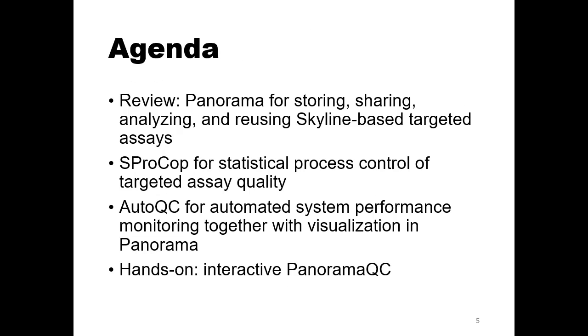So now that we have maybe a little bit of an appreciation for system suitability and what we're going to be doing on our mass spectrometer, I'm going to review extremely quickly Panorama. I'm going to talk to you about SProCop. I'll talk to you about a small tool called AutoQC. And then I'll show you some data that ties all this together.